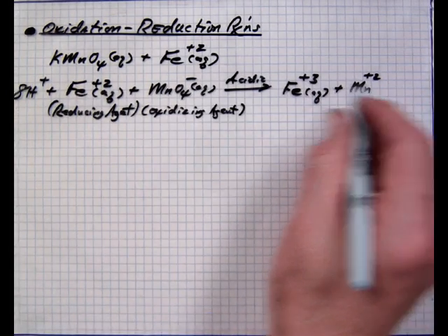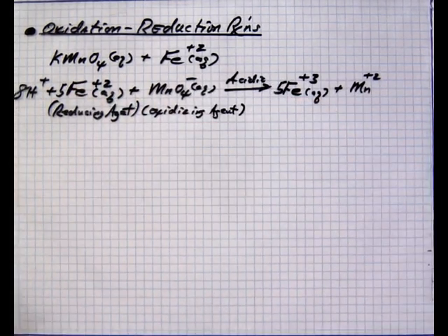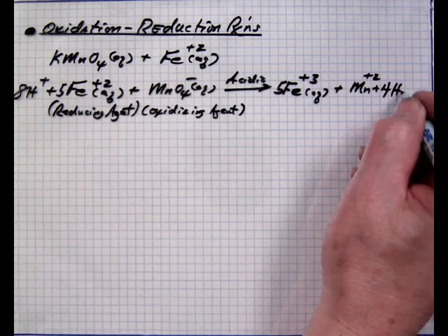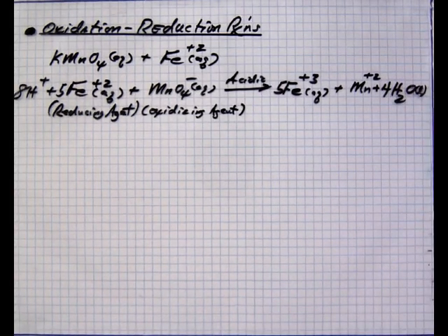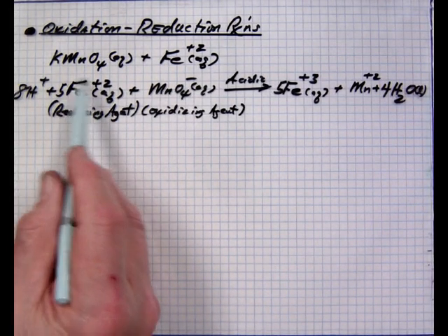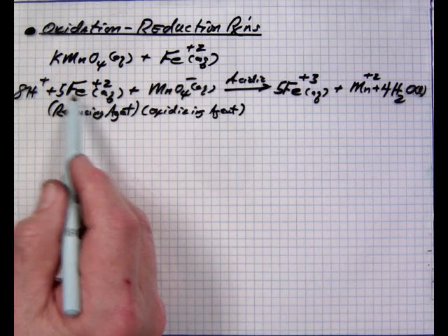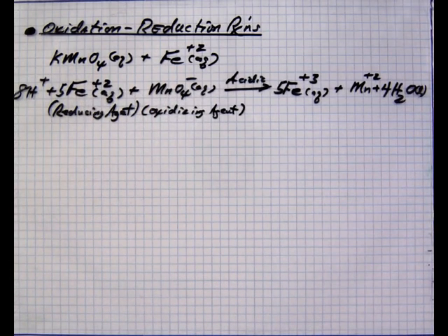And on the reaction we have 5 moles of iron, 5 moles of iron 3, and finally 4 moles of H2O liquid. So this would be set up primarily to identify the concentration of iron extracted from, say, an iron ore sample in an acid, and then you titrate it with the MnO4.